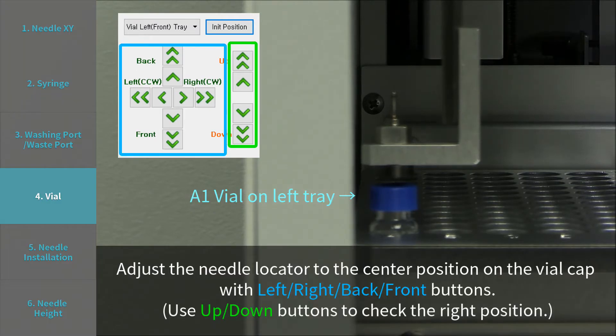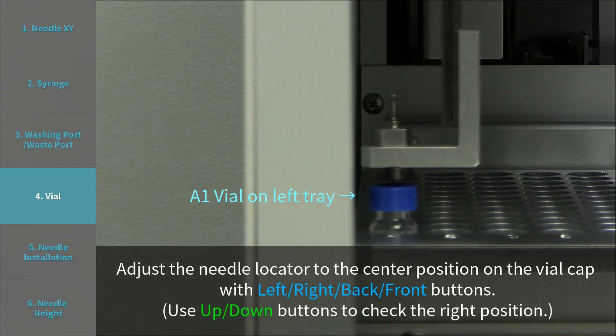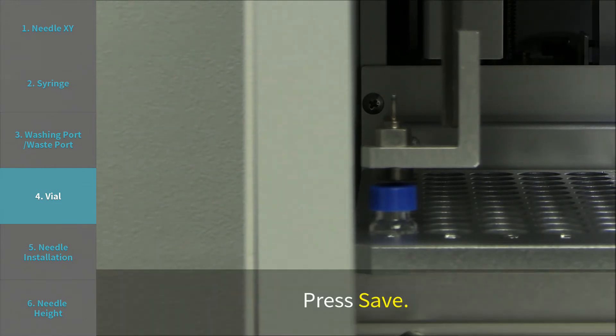Adjust the needle locator to the center position on the vial cap with left, right, back, and front buttons. Use up and down buttons to check the right position. Press save.